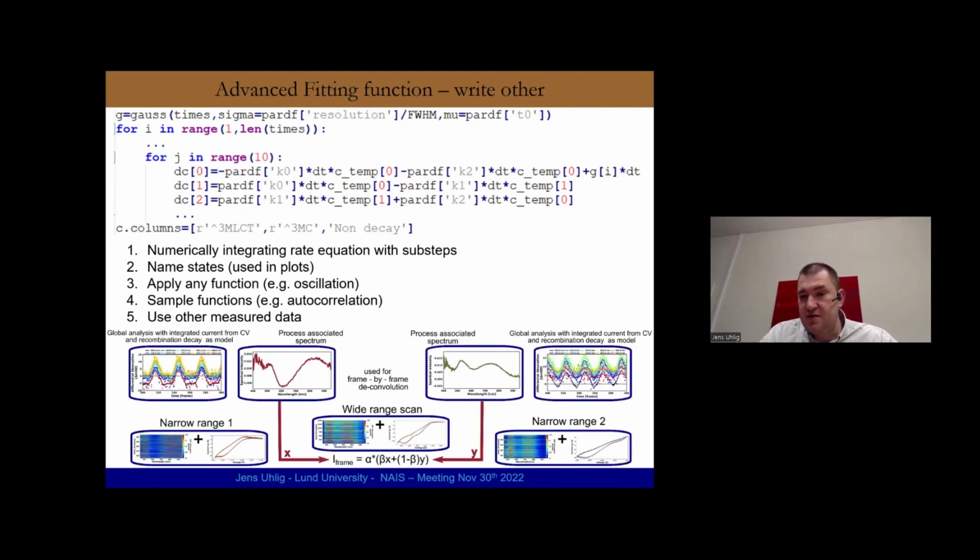For example, and this is just the last picture I show, I can use spectral electrochemistry, where I use the current which I measured in my potentiostat as a model to describe how many molecules have been converted. And then, for example, in that image, I oscillated the voltage up and down many times, and I turn on and off a spectrum.